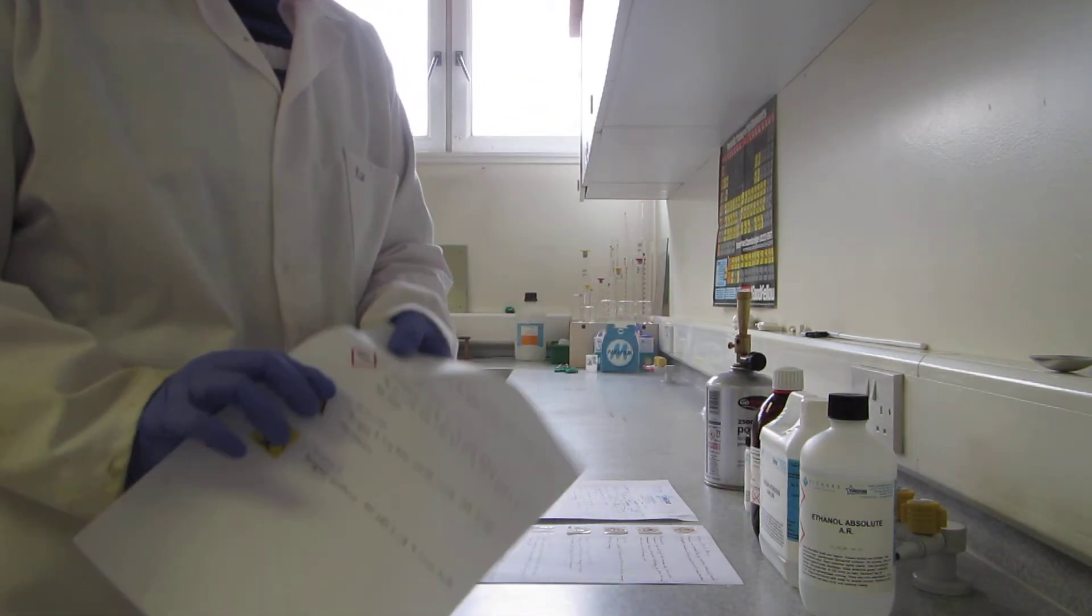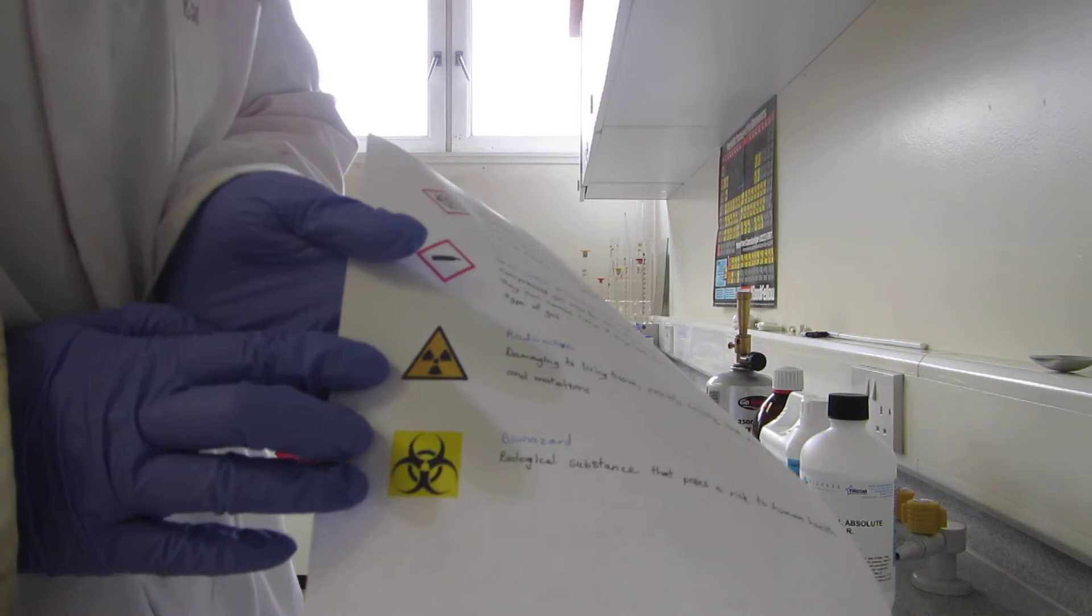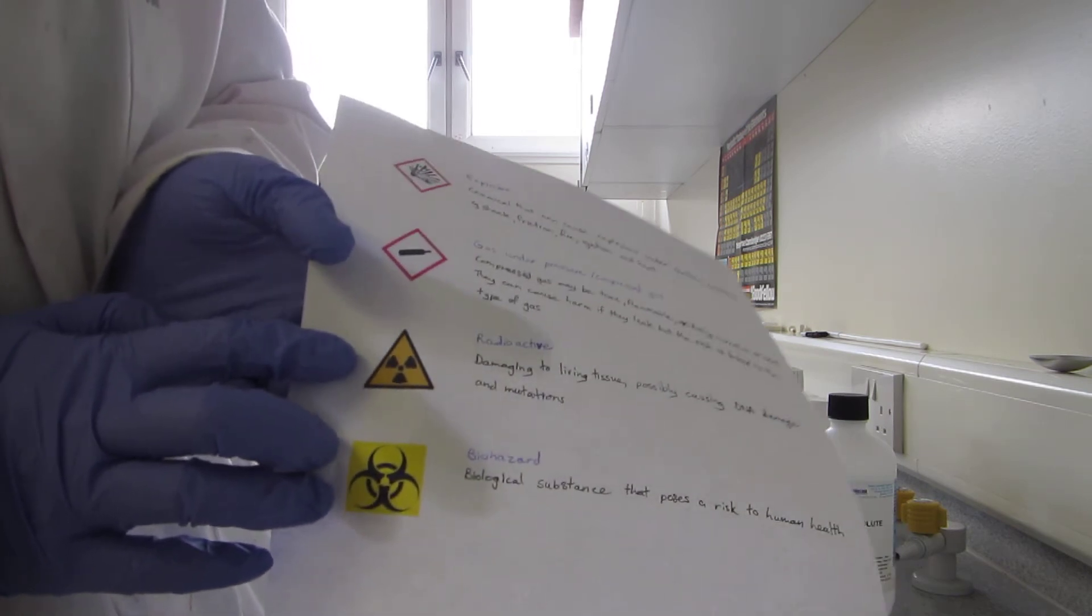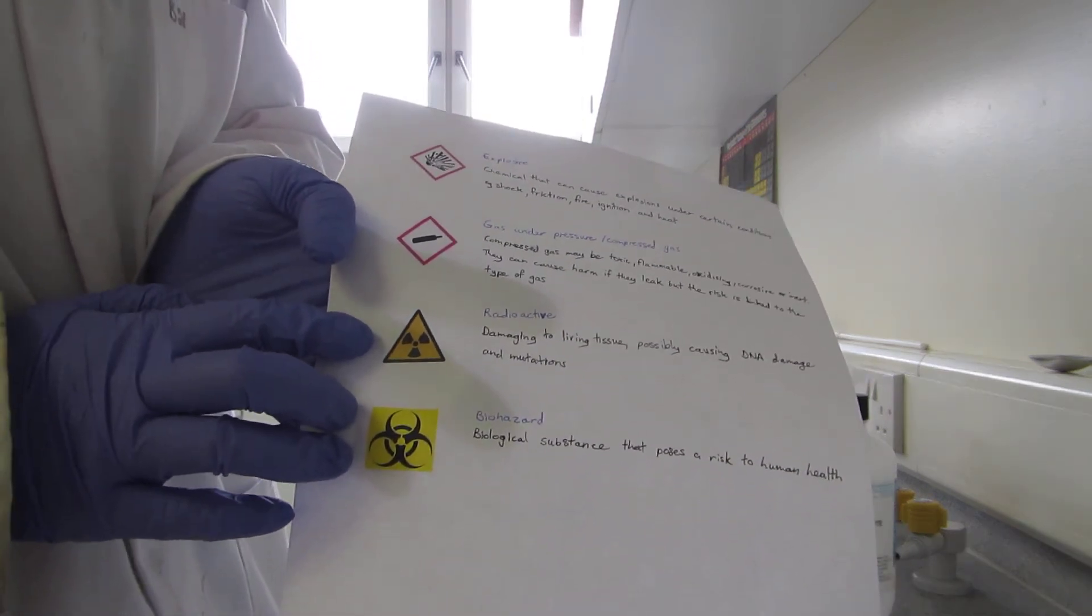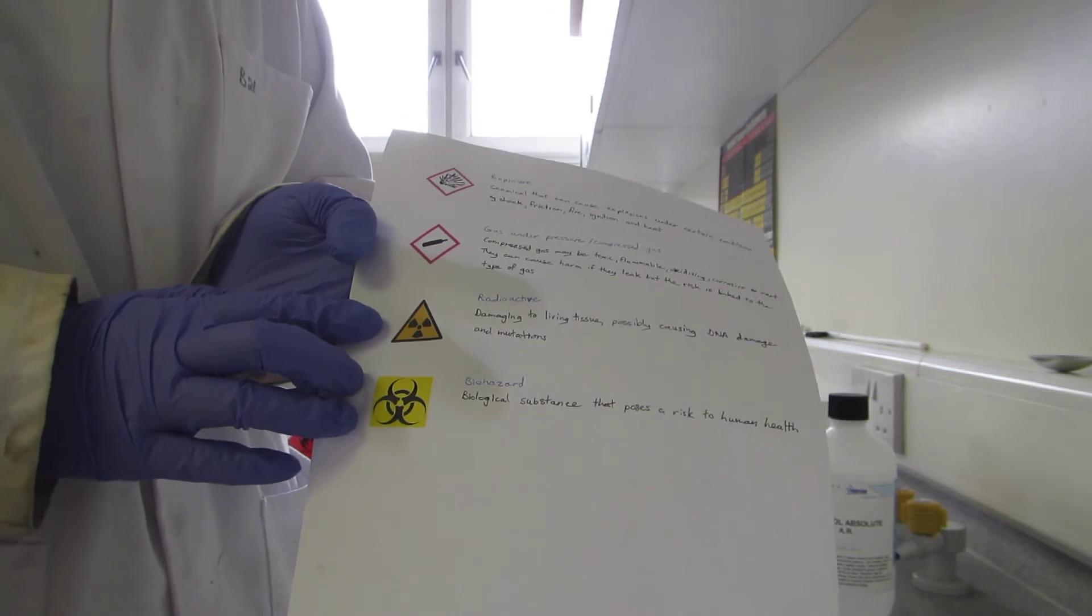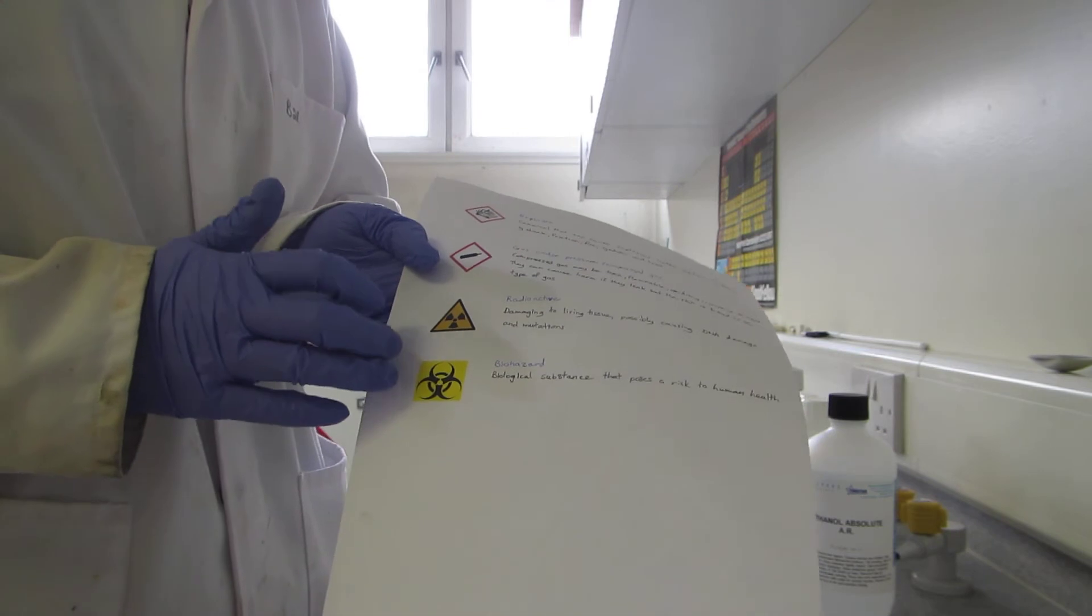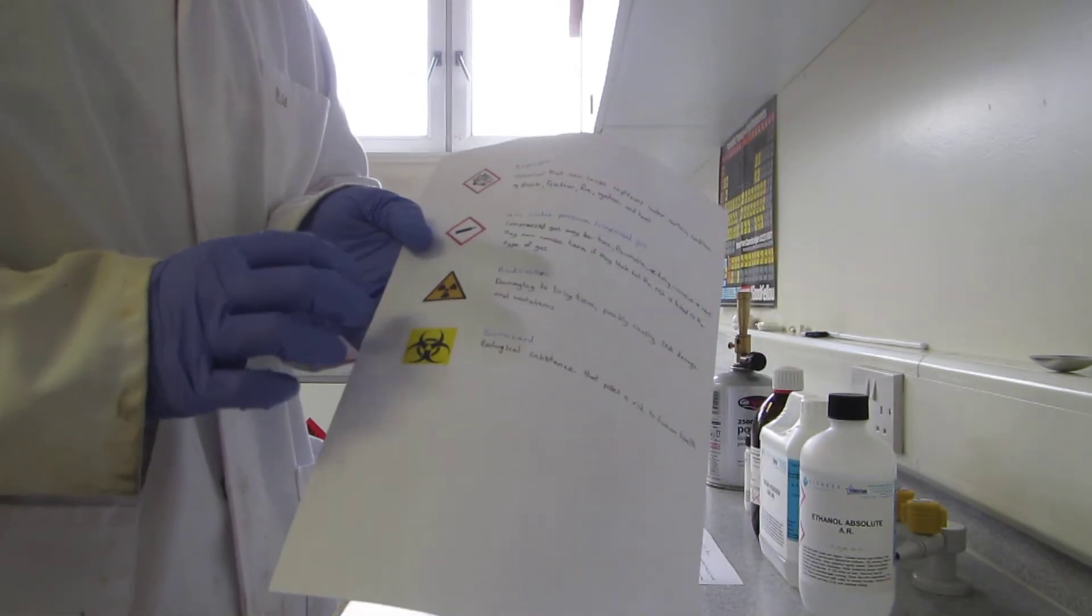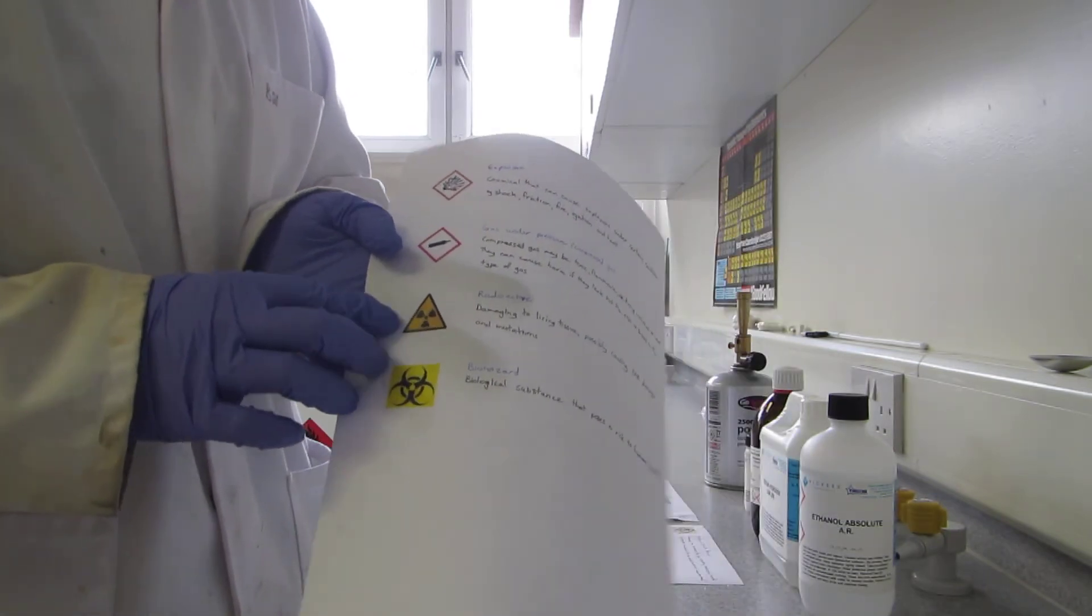The next symbol is for radioactive substances. This is anything that can cause damage to living tissue and potential DNA mutation. You would find it on gamma or beta sources of radiation. Again, because of the hazards associated with this, you generally only see them as a demonstration.